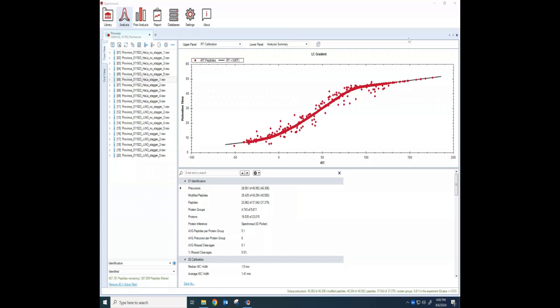I'm Dennis Provence from the IDEA National Resource for Quantitative Proteomics, and I'm making this video to explain a little bit about the Spectronaut viewer. If you do a data-independent acquisition experiment with us, you'll receive your data back with our differential analysis, but we'll also send you a Spectronaut file, which is a .sne file. I wanted to go through how to navigate through some of this.